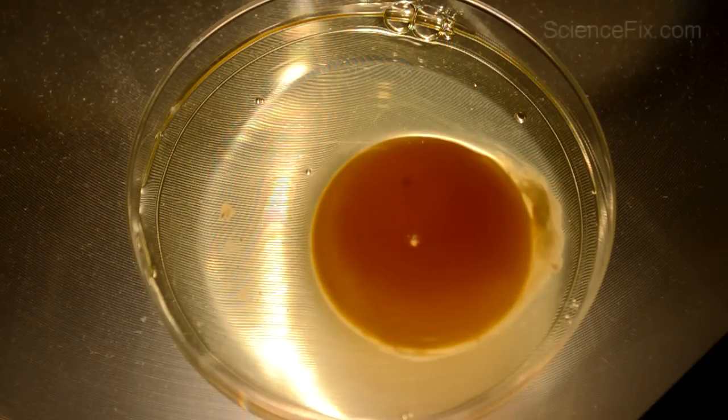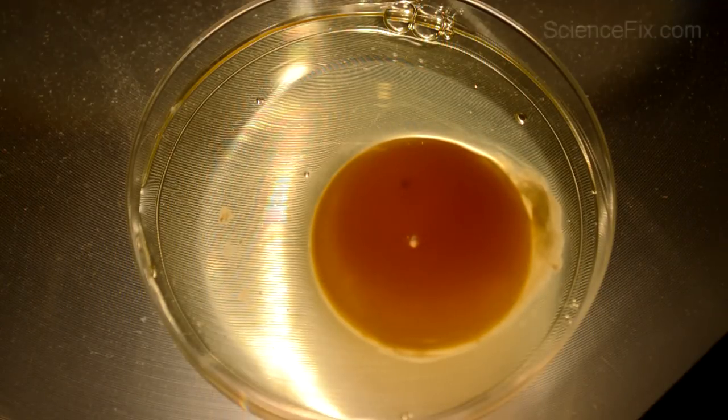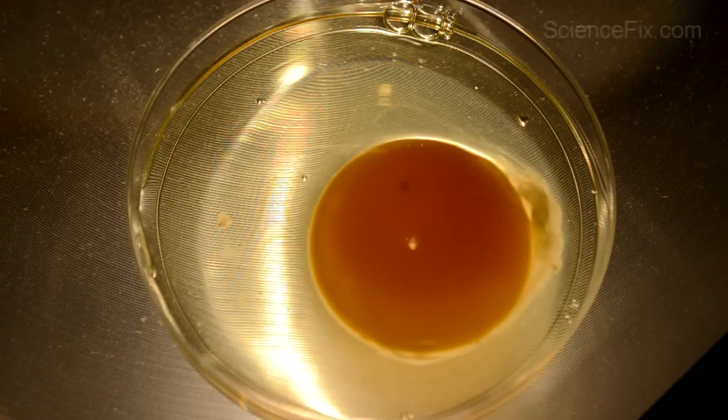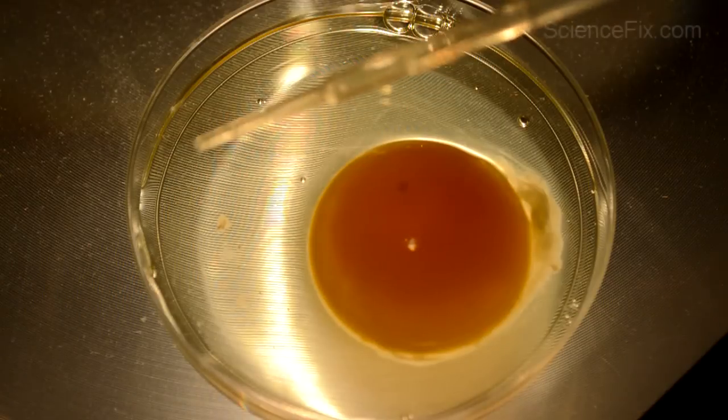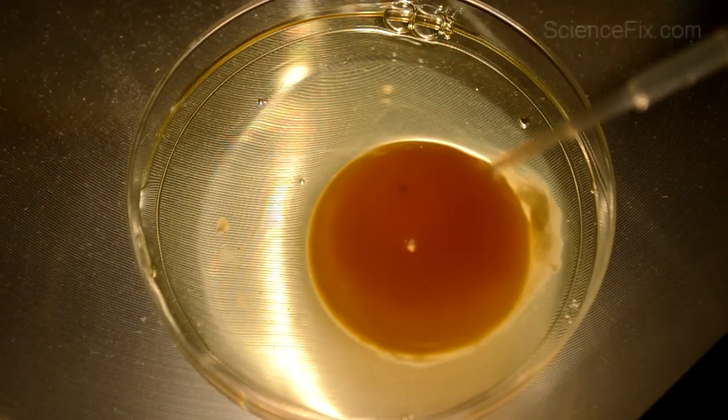The overhead projector is turned on, and light from the overhead projector passes through the egg white into the camera. So the egg white is acting kind of like a cornea or the clear liquid that's in the eyeball.